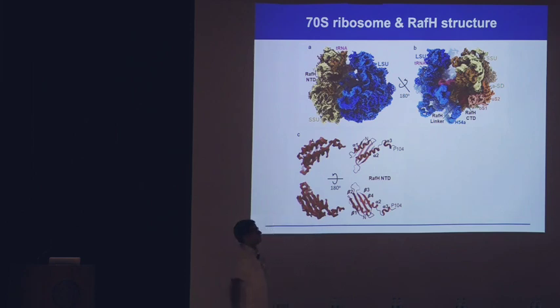In this, it's 1,53,000 finally. We started with 12 lakh and ended up with 1,53,000. Yes, not weeks, it's 3 sessions, 3 into 2 days, 6 days at the NCCS National Cryo-EM facility, yes. Yeah, our facility is for screening, we do only screening, yeah.